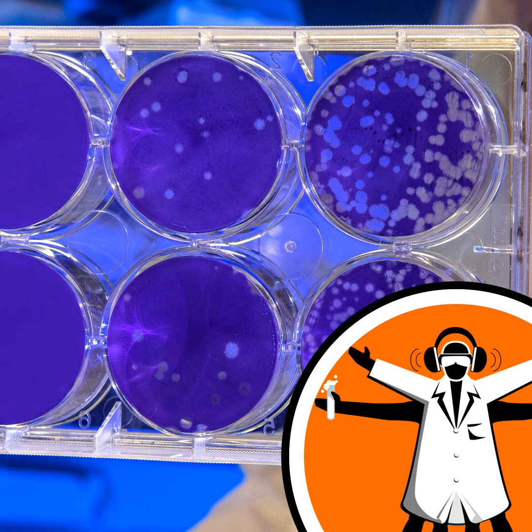And are we talking a machine learning algorithm like we've seen before? Like it looks at a bunch of other samples and it learns from that, and then with new ones it can figure it out? Yeah, exactly that. So we have not told it what a bacterium looks like. Not at all. What we've done is we've taken a few thousand images and told it to look out for similar things.